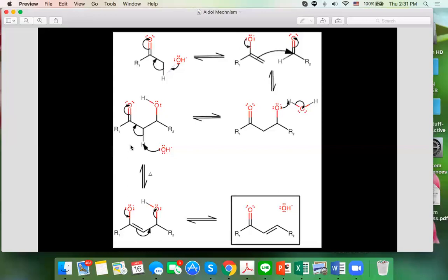It is super, super, super, super important, because I want you to write your balanced equation this way. In the lab procedure, the lab manual we are using, you will be using acetone. So you have two equivalents of alpha hydrogen, and both sides will give you a water molecule. Do you hear me? Yes and yes? Okay, thank you.